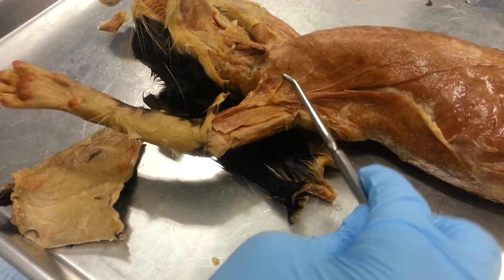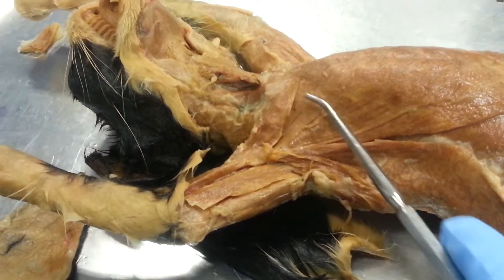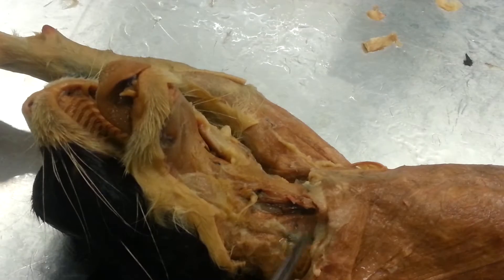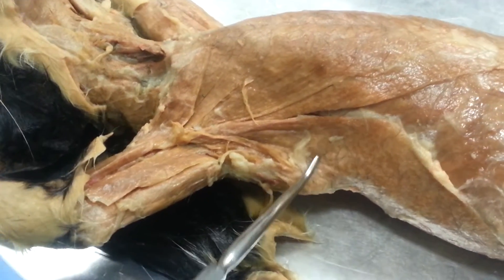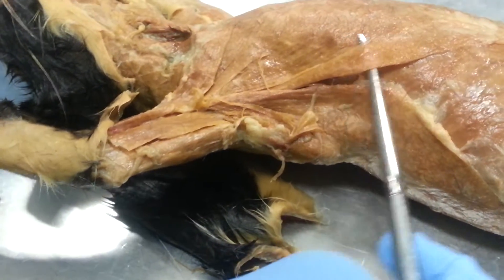So the pectal antebrachialis is this. And then underneath is the pectoralis major, right here and also right there. And then you have the pectoralis minor, this right here. And then on the side is the xiphihumerus.